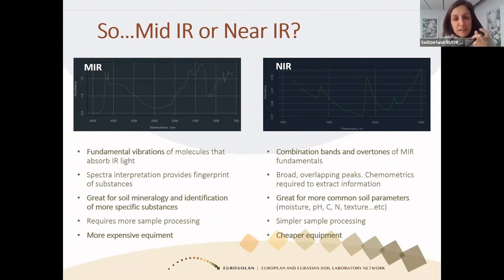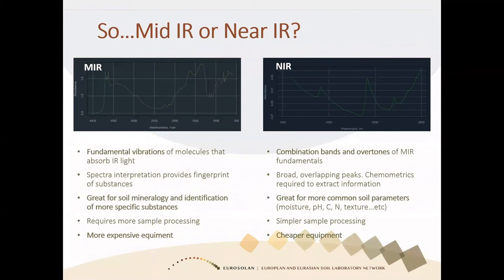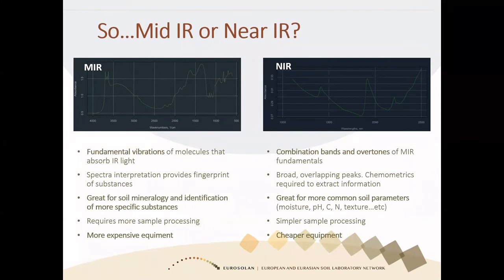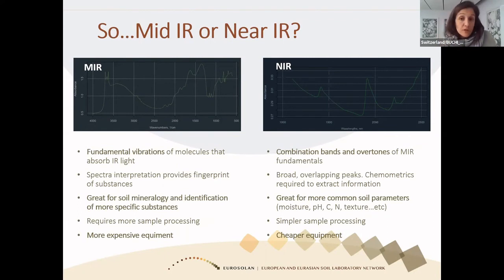If you want to study more in detail mineralogy and this kind of thing, or pesticides or things like this that you can identify in the spectra, then MIR is probably better. And also, with MIR, if you want to quantify, you also need chemometrics anyway. So from that point of view, there's no advantage in any of the two, but yeah, MIR is more specific.